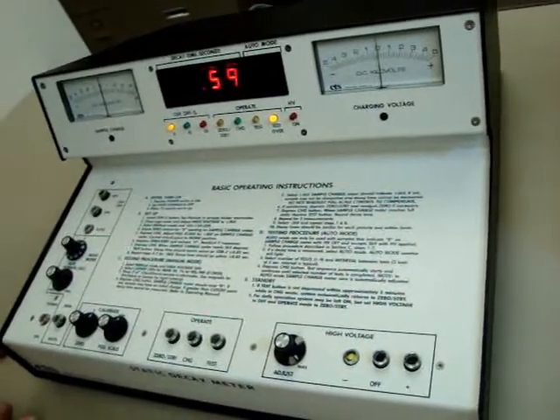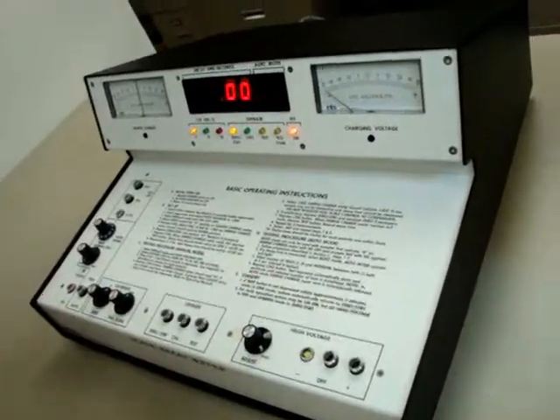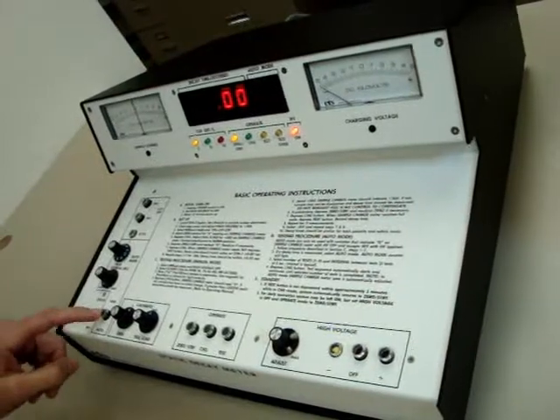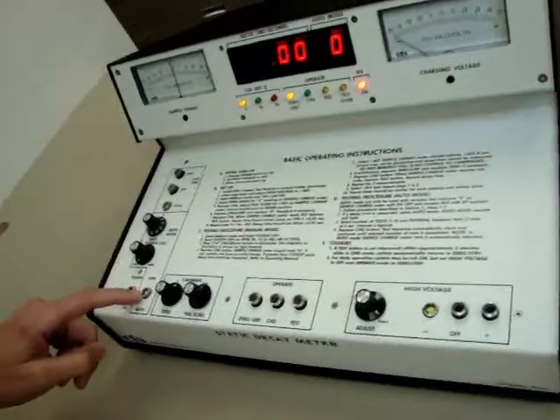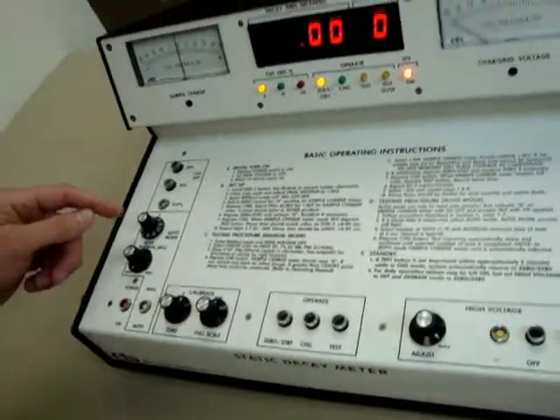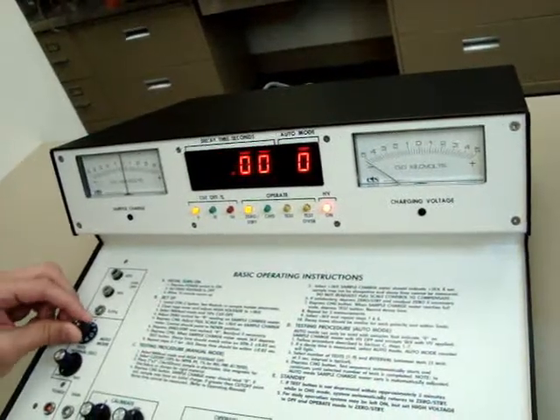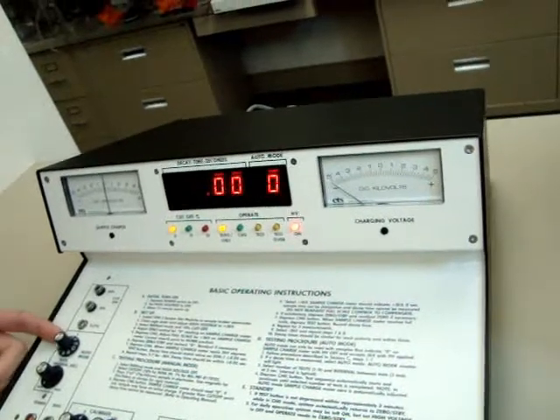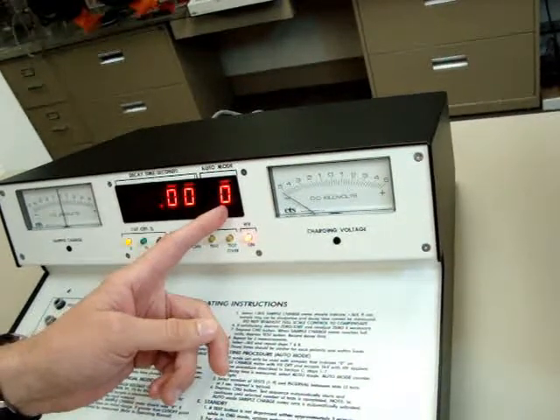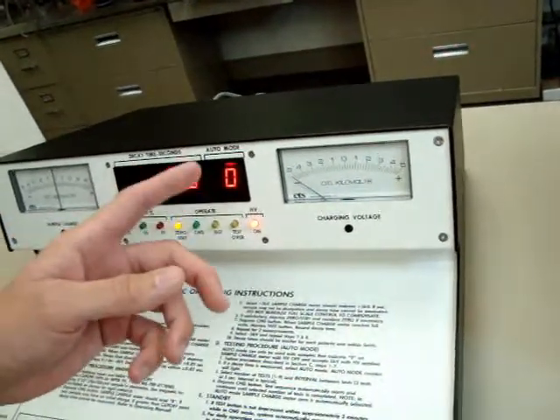Now we want to demonstrate the use of auto mode. We'll leave it in the negative high voltage position for this test. To run in auto mode, we depress the auto mode button. Auto mode is indicated by a color indicator — in this case it's white, meaning we're in auto mode. Next, we adjust the number of counts in auto mode, which is set to three. You can set it anywhere from one through nine. In this case, we're going to do three tests. Notice a display LED comes on when you select auto mode, and it will display the count number each time a test runs — going one, two, three.